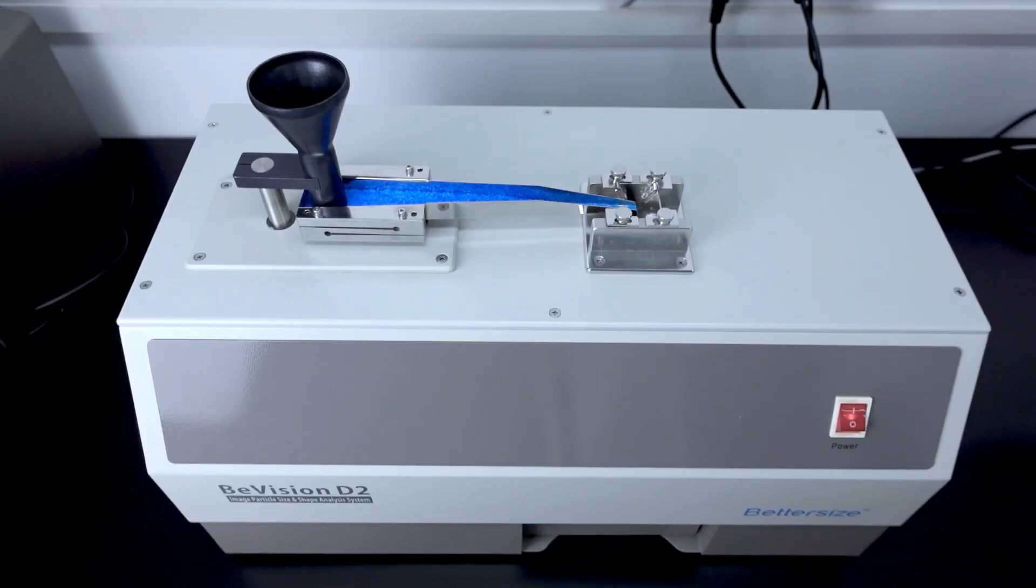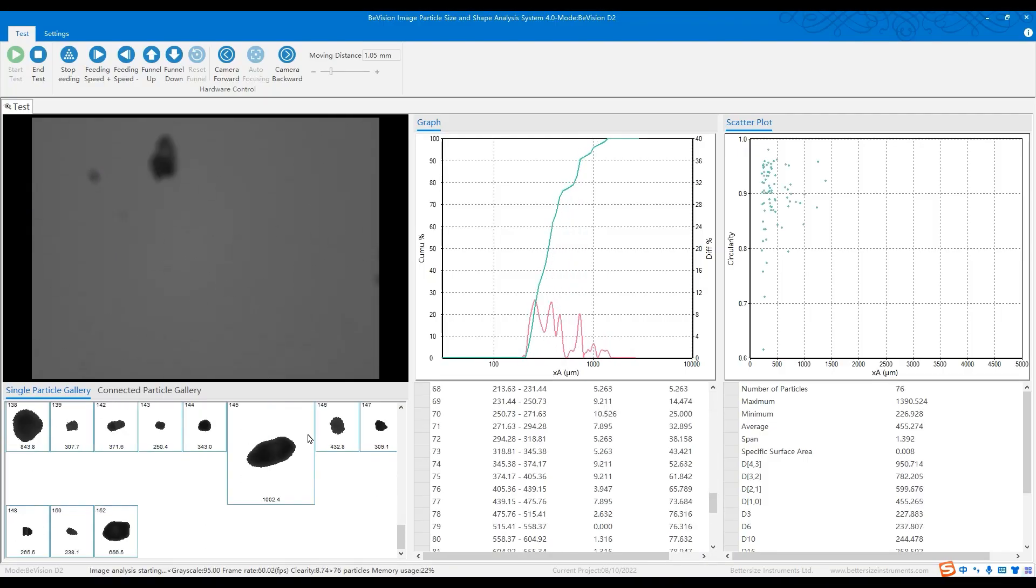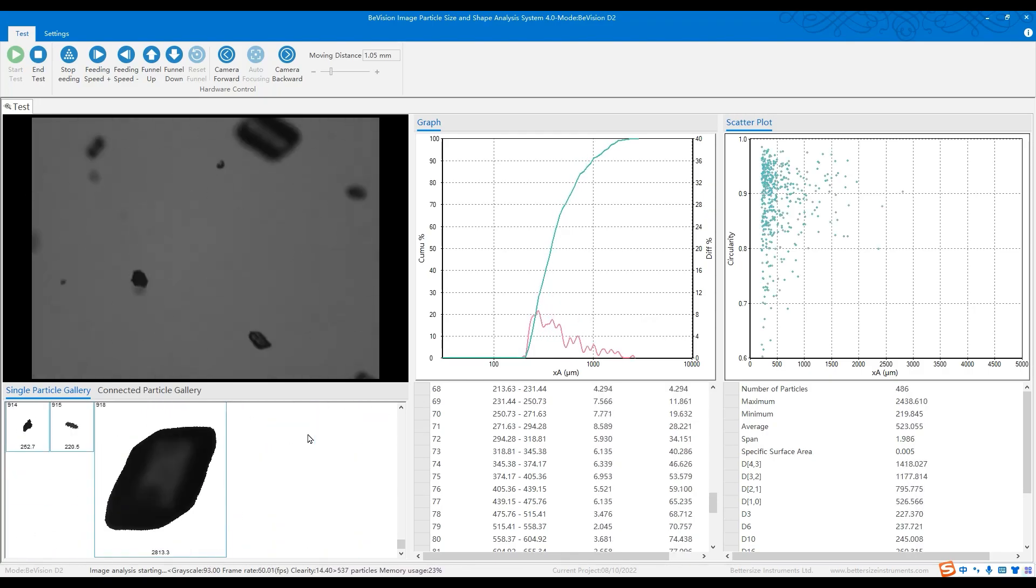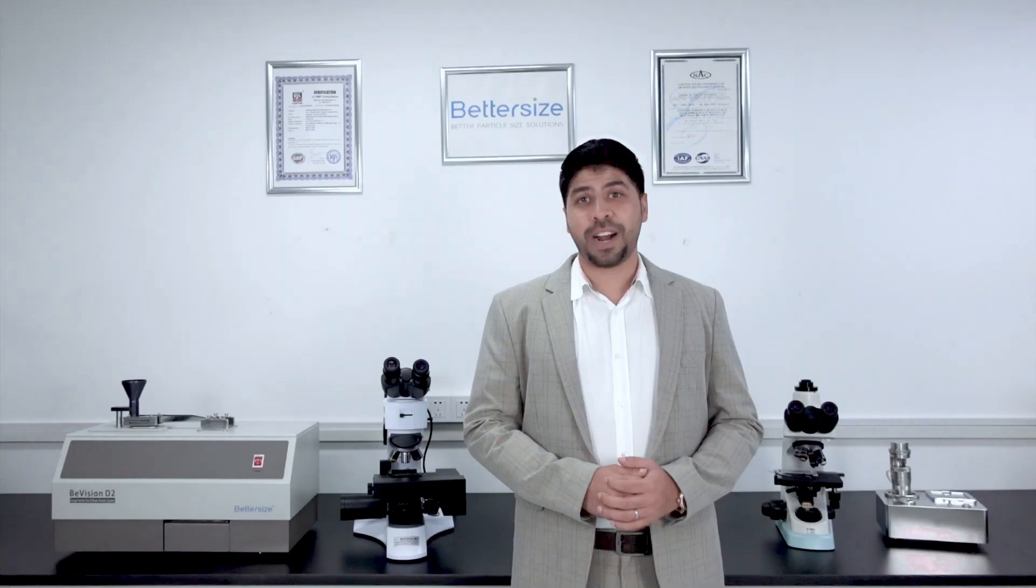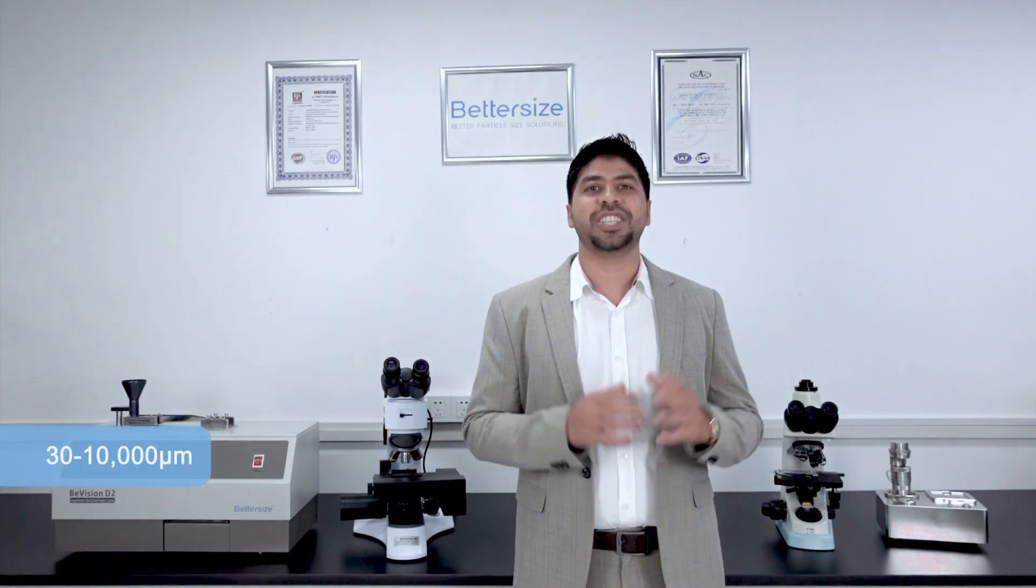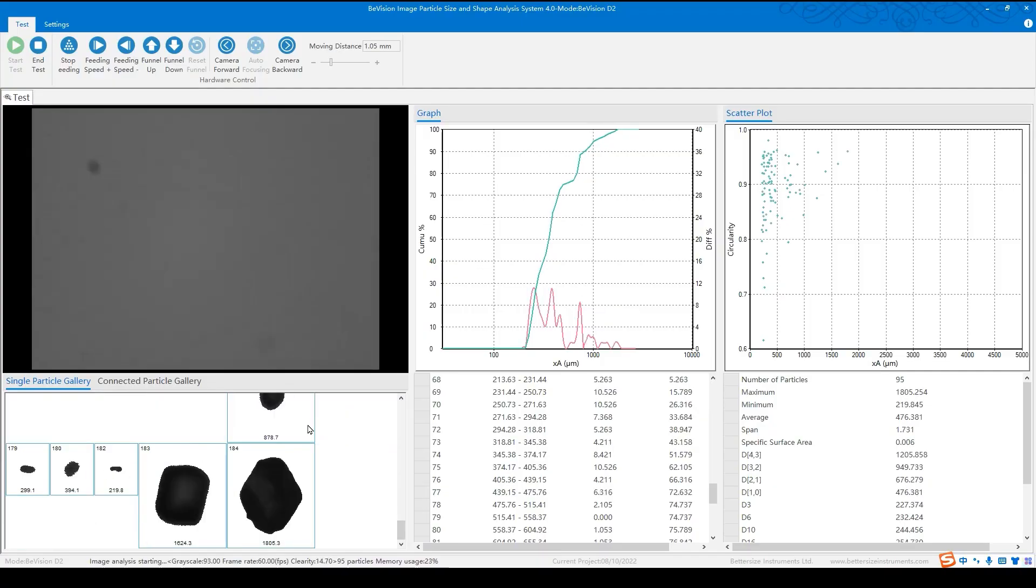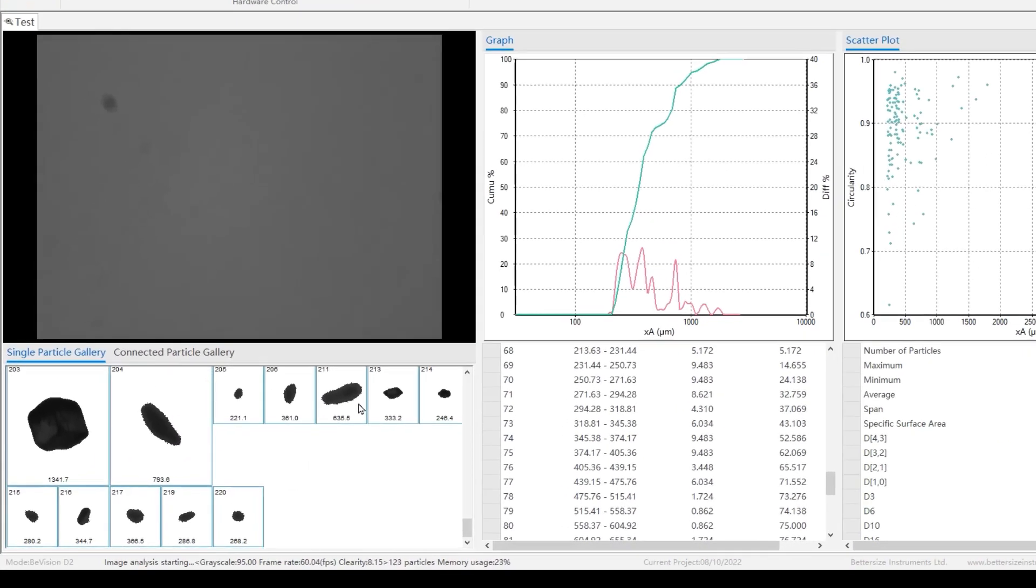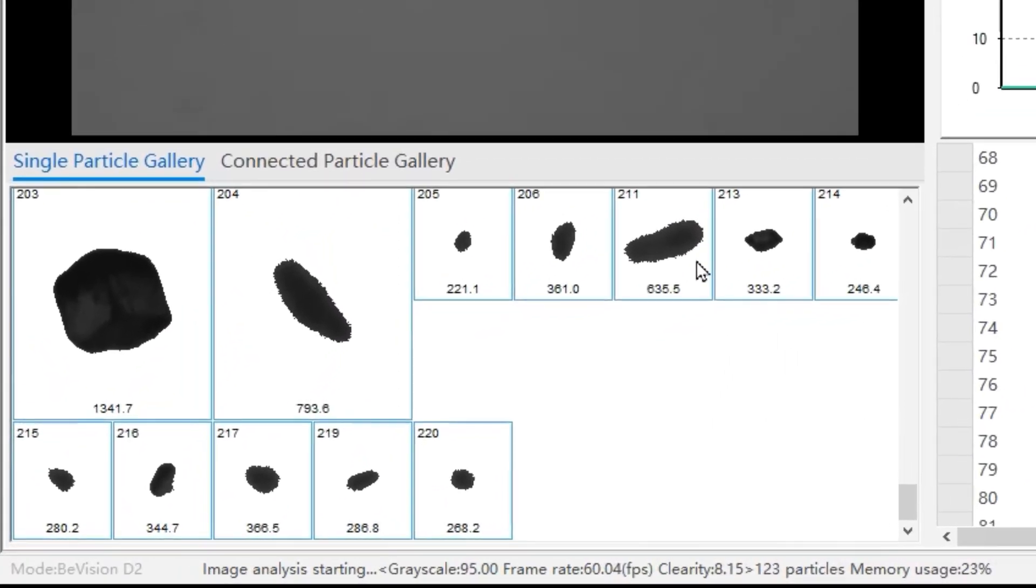The BeVision D2 features dynamic image technique to look at thousands of particles in motion, delivering statistically relevant data on particle size and shape from 30 to 10,000 microns in just a few minutes. Meanwhile, thumbnail images of each particle are saved for post-analysis weighing and screening.